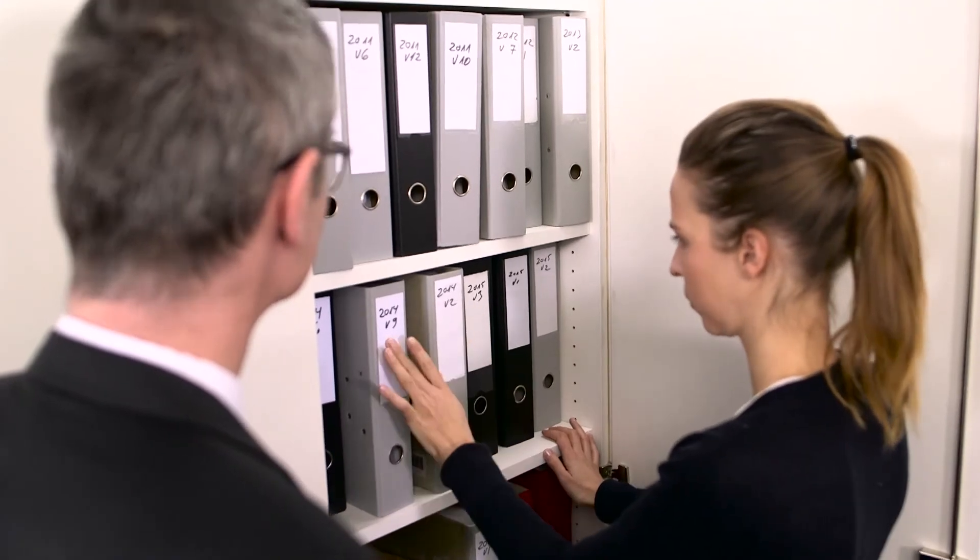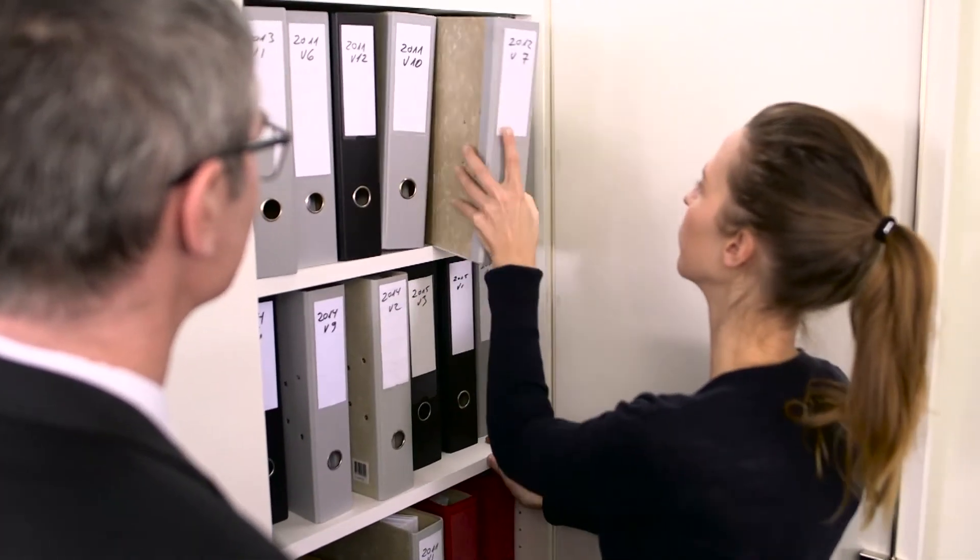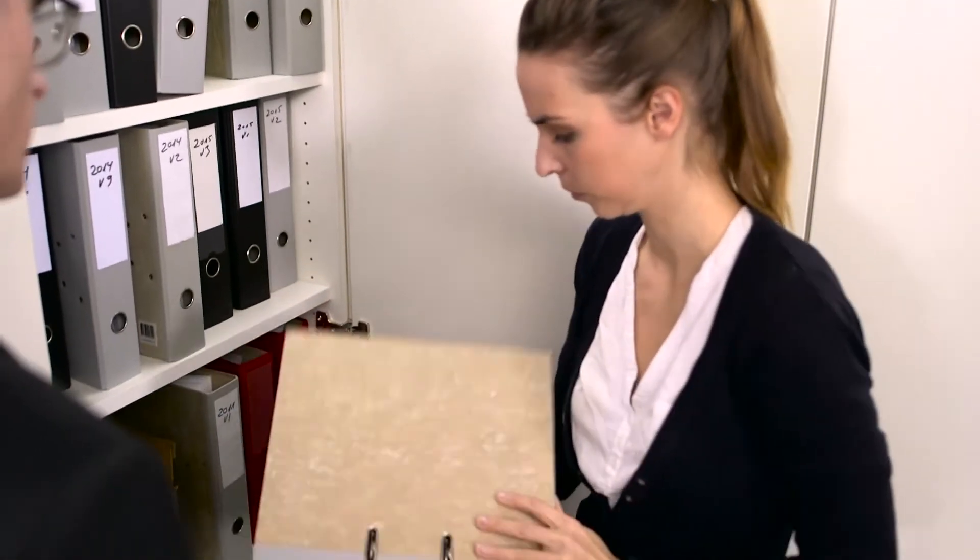Many labs still file away piles of paper hoping to satisfy regulatory audits, the results, disregarding the associated metadata.